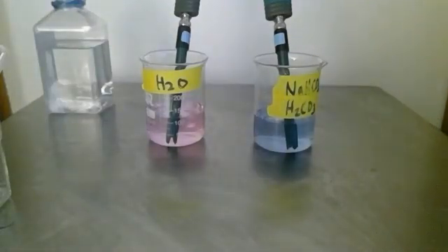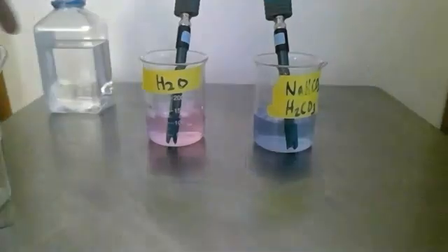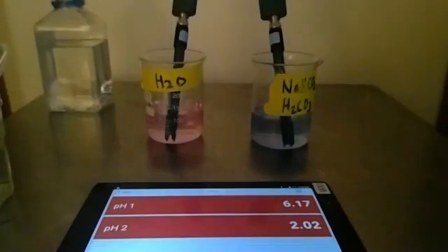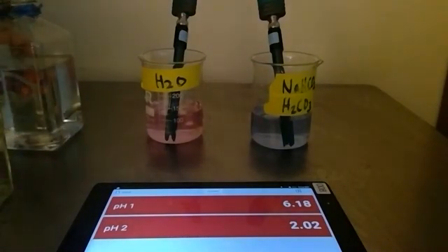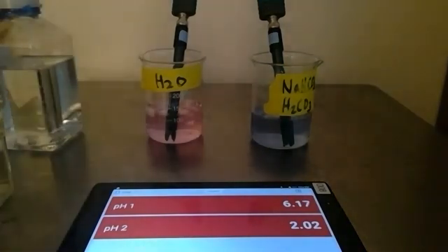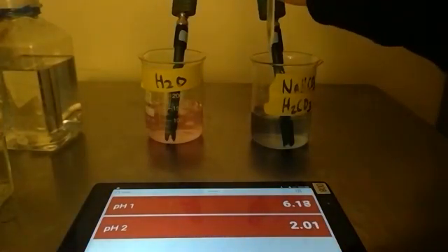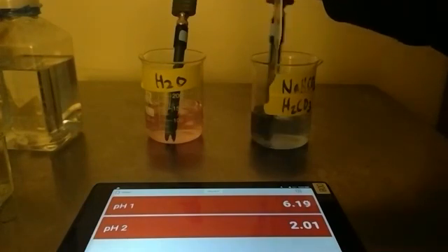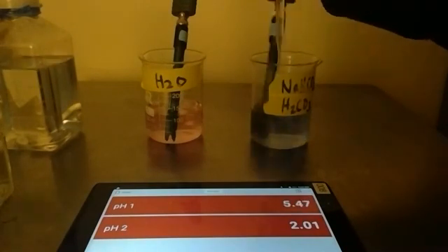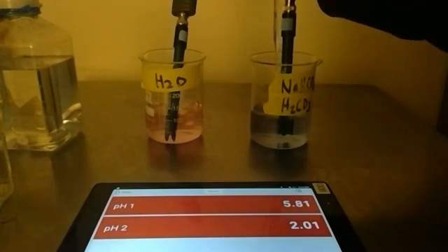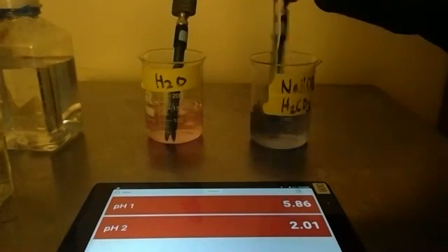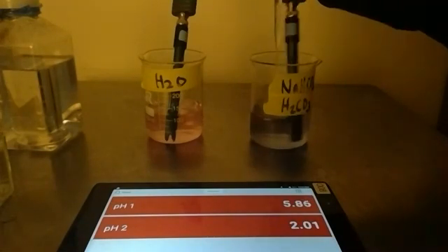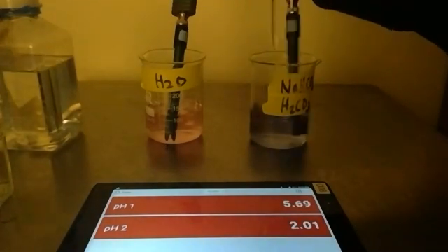Now let's compare as we try to reach the buffer capacity for our buffer. We're at a very acidic solution for our water already. Hopefully you've counted the number of drops so far. I'm going to go two drops at a time and stir. One, two. We're looking at the pH of sensor one, which has now come down to 5.7 ish, 5.8. Five, six. We're at a pH of 5.7. Seven, eight. We're at a pH of 5.5. Nine, 10.